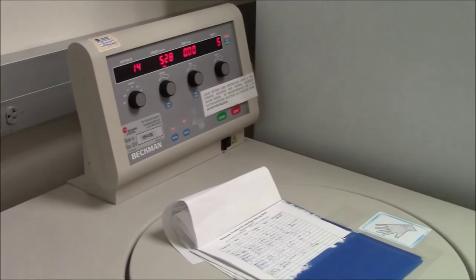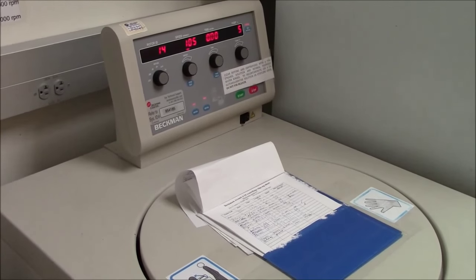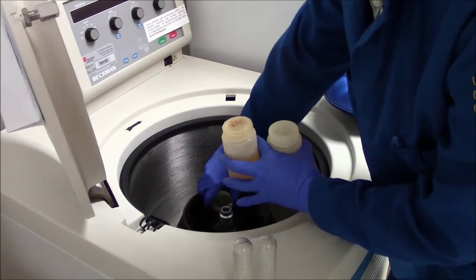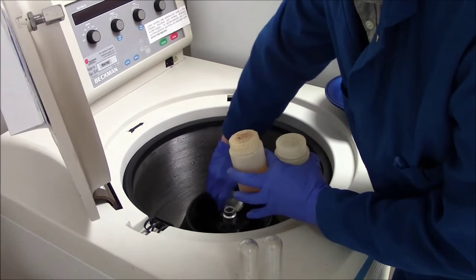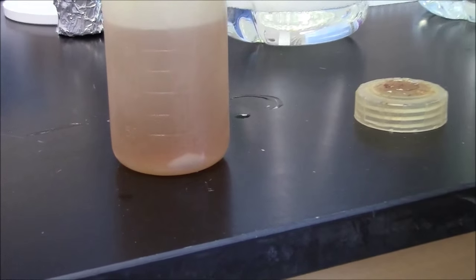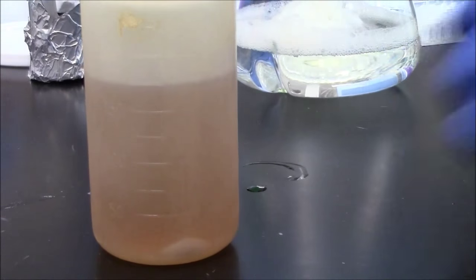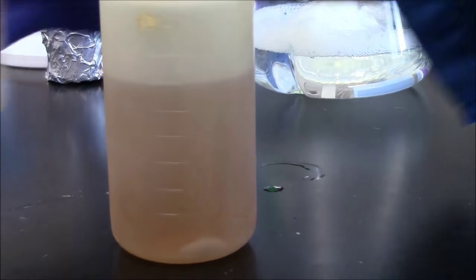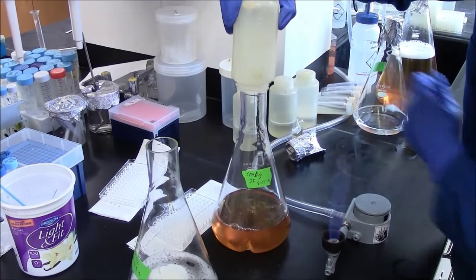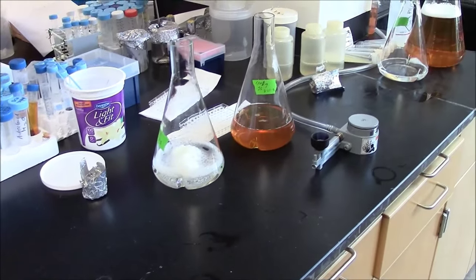The centrifuge is spinning down now, and we'll open it up to see whether we have collected phage as a precipitate. There the bottles come out of the centrifuge. We'll be looking for, there it is, the pellet right in the corner of precipitated phage. There may also be a streak running up the side of the bottle. The supernatant now is trash, so we'll discard that into a disinfecting flask. And then we'll have to spin them again.